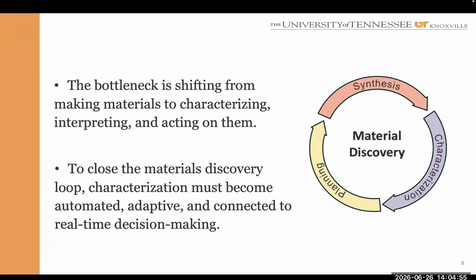And often, let's say, half of my talk, I am starting with this very general slide, where you may see the representation of our pipe dream, or maybe better to say, ultimate goal. So it is a scheme of automated material discovery, where we can represent the whole process as a kind of iterative cycle, where each iteration essentially consists at least of three main stages. It is synthesis stage, characterization stage, and planning stage.